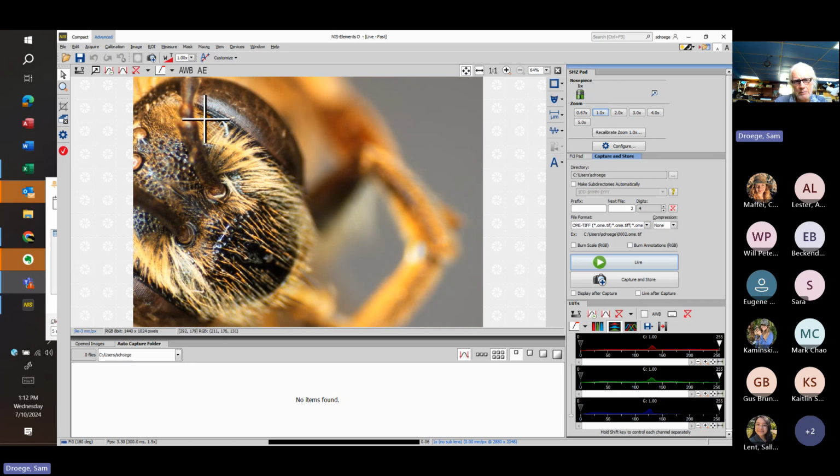Okay, we'll move this around a couple times so you can see this. What you're looking at here is the fovea that's running here, and then there's the bottom part. So here we have very wide, filling up most of the space between the compound eye and the ocelli. And then you can kind of make it out as it crosses underneath the hairs here. This is just a really narrow slot. So the ratio is this width at roughly the level of the antennal sockets, and the greatest width up by the ocelli, certainly greater than 3 times wider up here than down there.